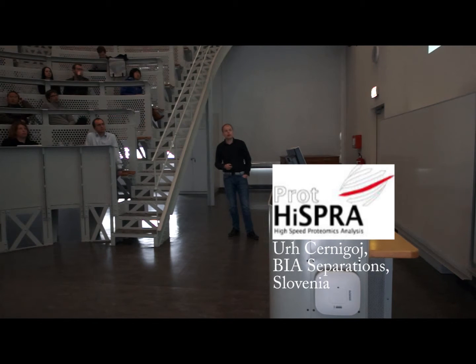After it is approximately double, and if you calculate this difference, this 7 square meters per gram, and if you know the amount of titanium dioxide, and if you just use simple geometrical equations, and also if you know the surface area of the material itself, which is 170 square meters, it matches. So this increase of the surface area matches the increase of the surface area due to the immobilization of the titanium dioxide.